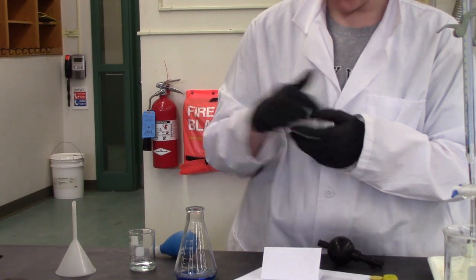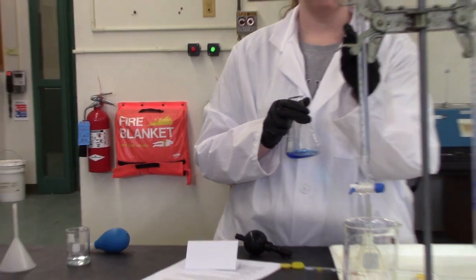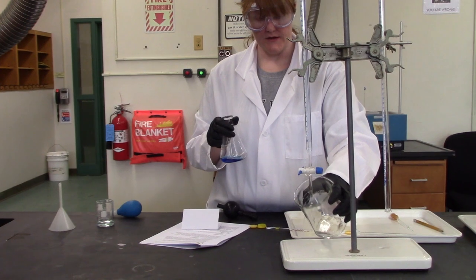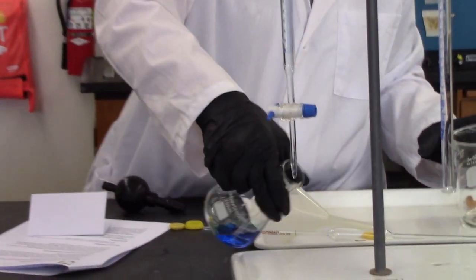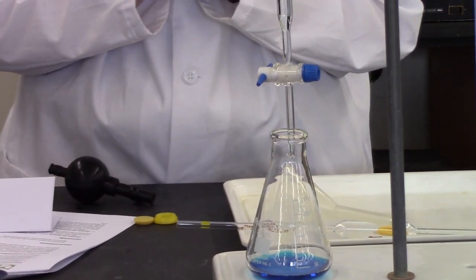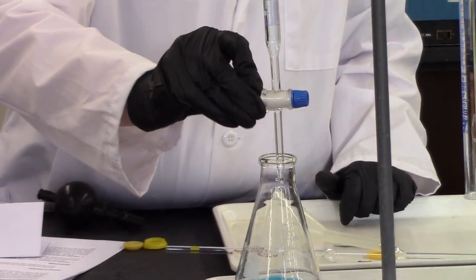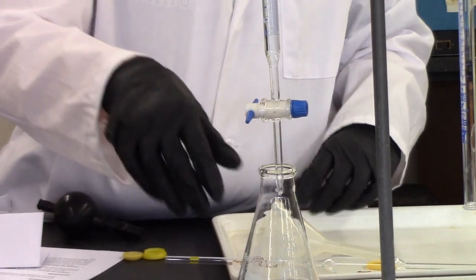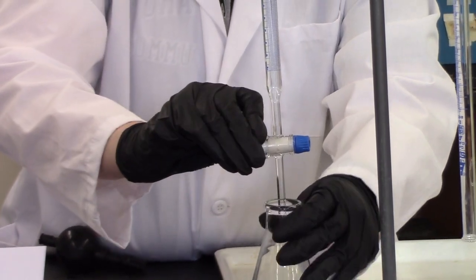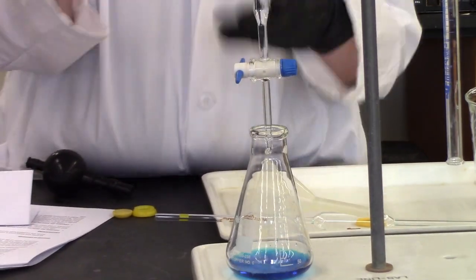Okay, so what we're gonna do is take this solution, and you've already recorded your initial volume, or if you haven't, you should do that now. And you wanna get this little droppy off there, okay? And you're gonna put your acid and phenolphthalein solution right in there, and you just titrate it, which means you're gonna add some base relatively slowly. I find the best method is to use my dominant hand to control the valve, and I use my off hand to kind of swirl this, okay? So you're just gonna do this, you're gonna keep adding, keep adding, keep adding.